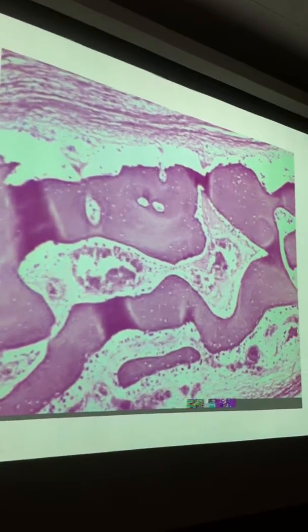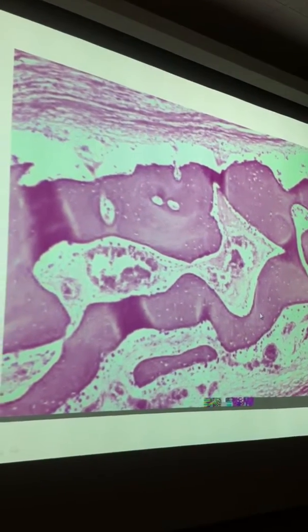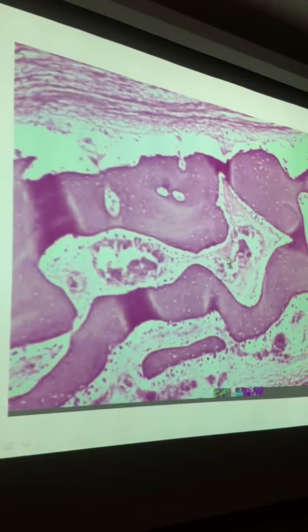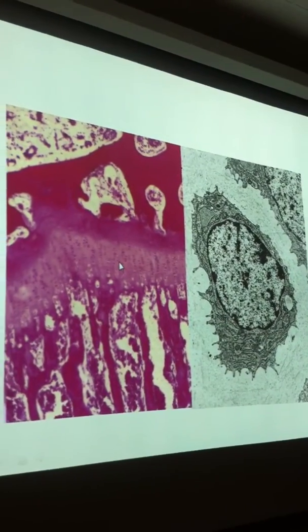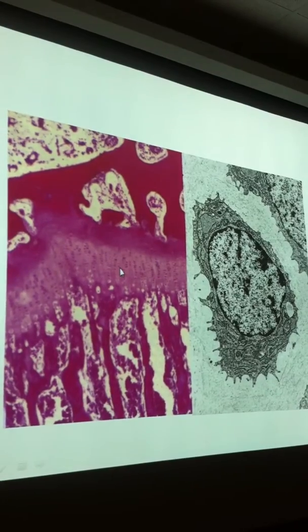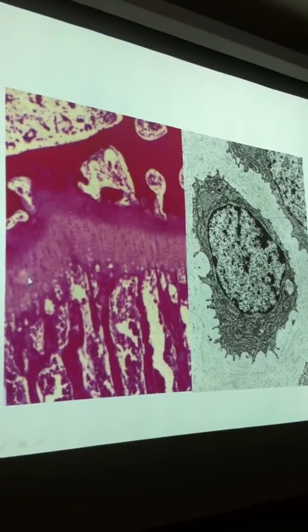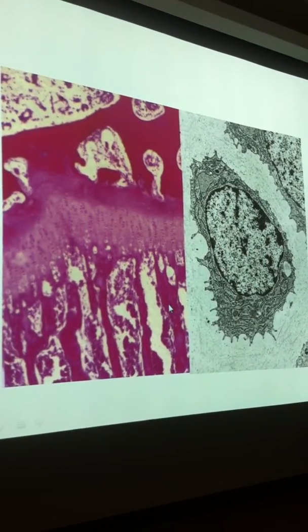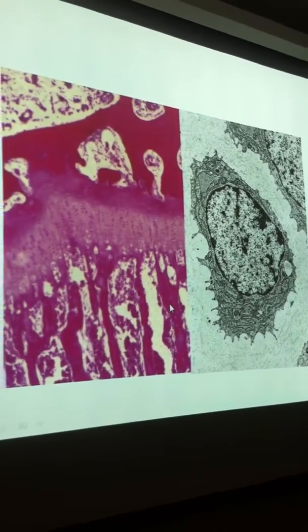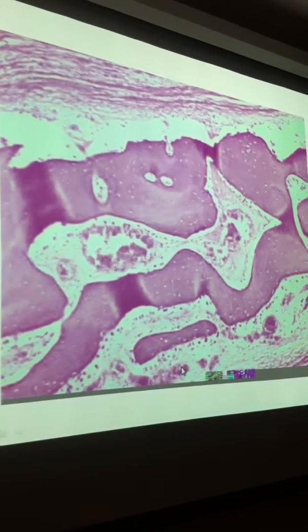So these structures are called bony spicules. And this is a figure of intramembranous ossification. Bone is forming from scratch from mesenchymal tissue. Lots of blood supply in the area. Now, different to this, you see this? Now you get to see a figure of endochondral ossification because you see cartilage turning into bone. But over here you didn't see cartilage at all.